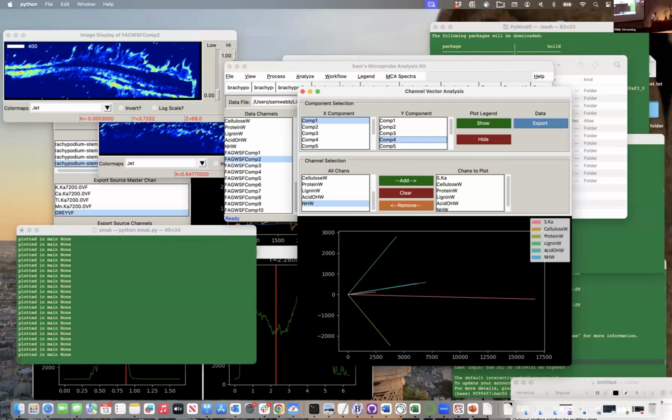That's just a feeling question, maybe. Do you think that if we collected this data on the same scale, the correlations would be better? We could have, but we didn't. It could have, yeah. A variety of reasons. We had a few things that made this a challenging data set, which is why it's a really good example to show the biggest challenges that we're running across with multimodal data sets.